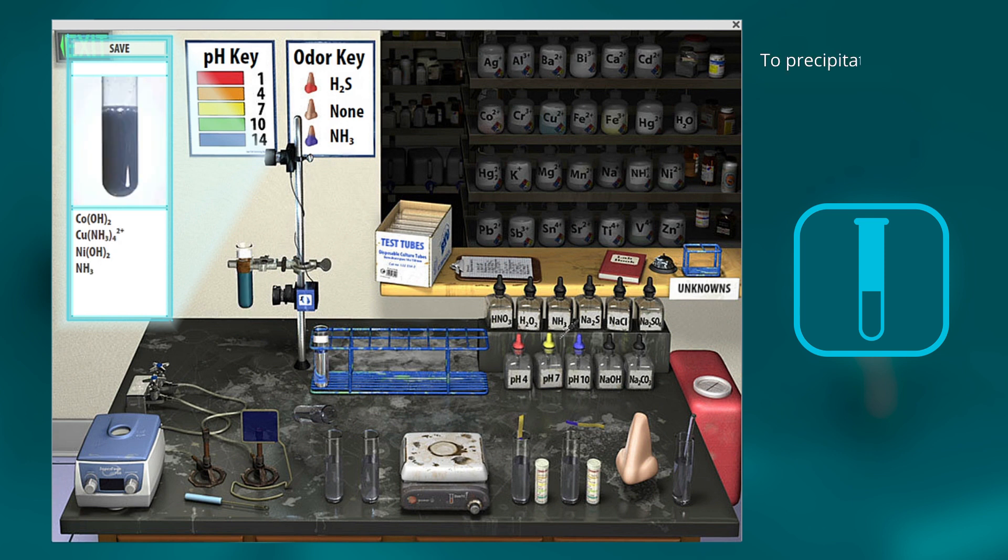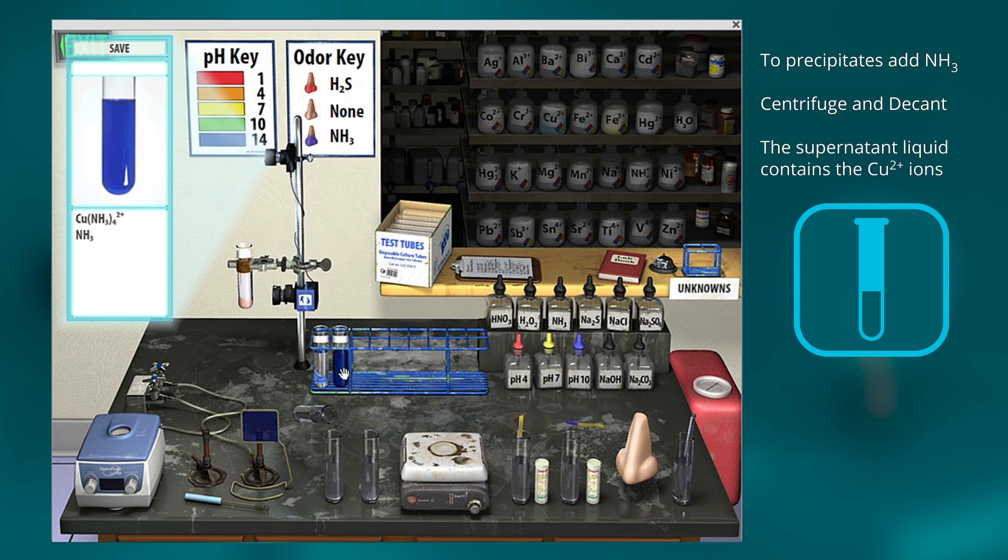Now I'll add some ammonia. You can see that one of them is not precipitated out. It's in solution, so I can centrifuge and decant.